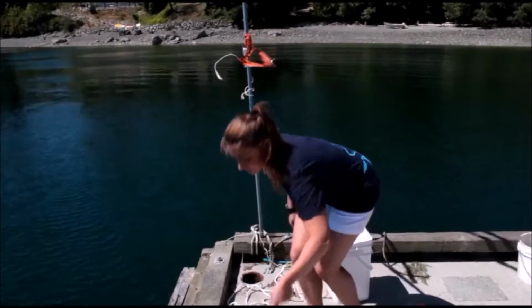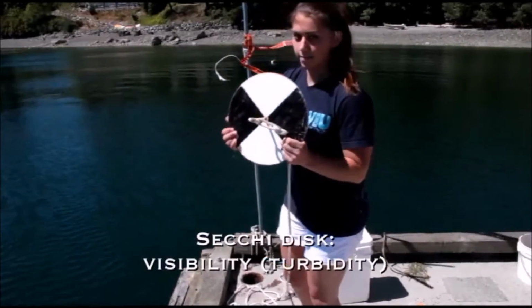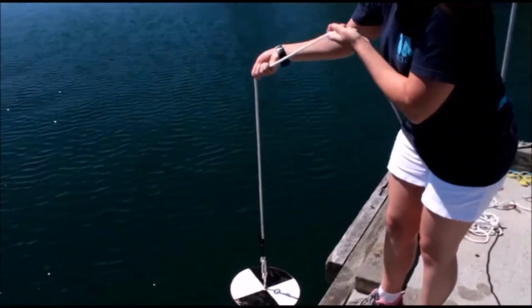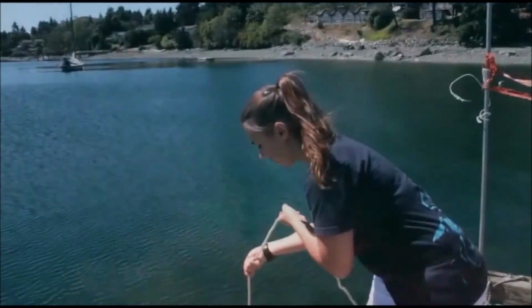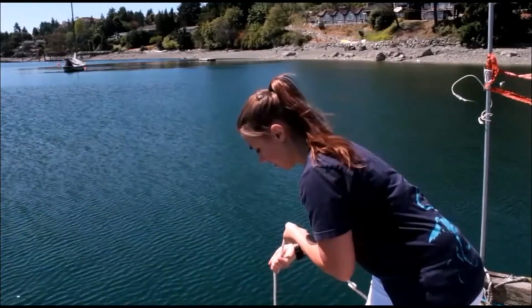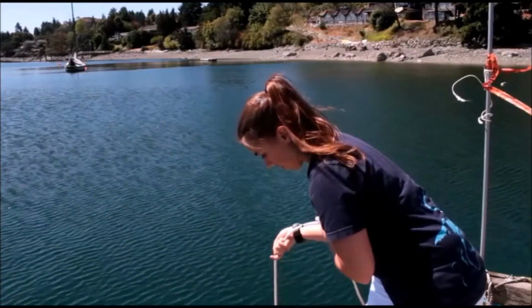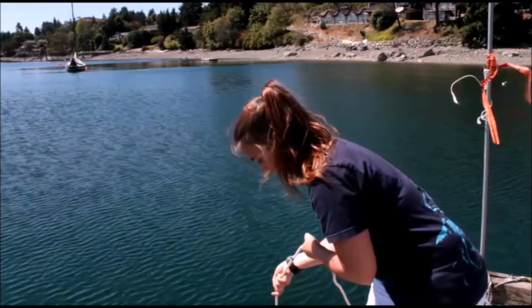Last measurement we'll do is a Secchi depth, a measurement of visibility or turbidity in the water. This is actually a freshwater Secchi disc with the different quadrants of black and white. In marine systems, more usually the Secchi disc is all white, a foot across, 30 centimeters. And it's a very simple thing to use. You just lower it down till you can't see it anymore in the water, and then bring it back up until it's visible. Maybe take a few tries of lowering, bringing up before you see exactly when it becomes visible.